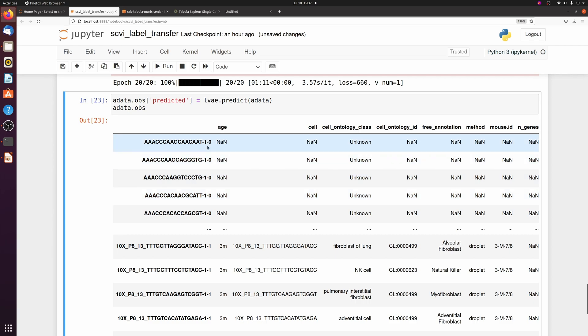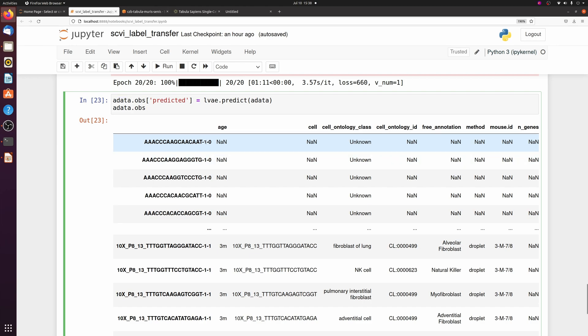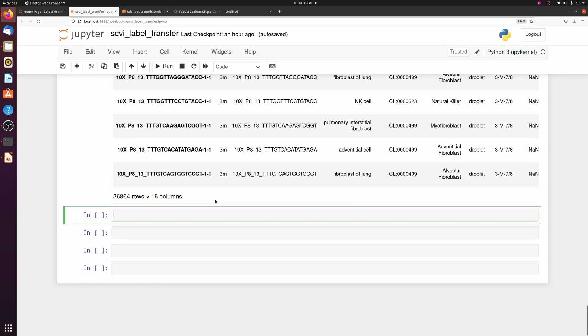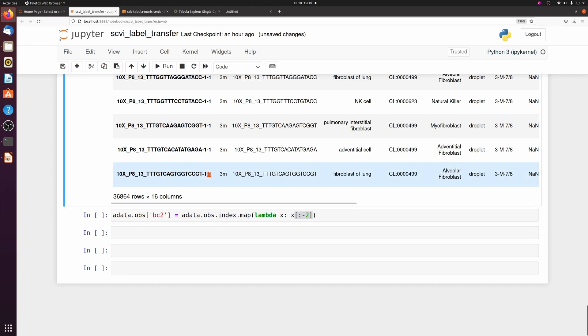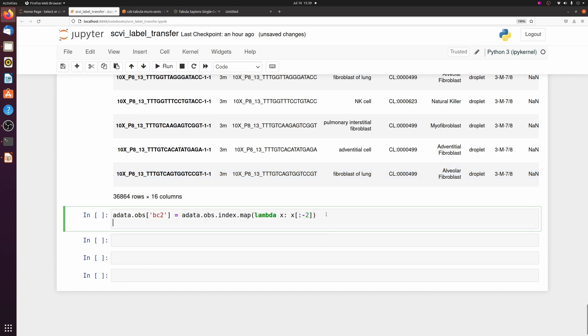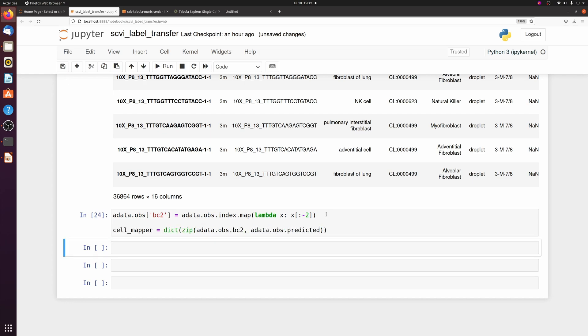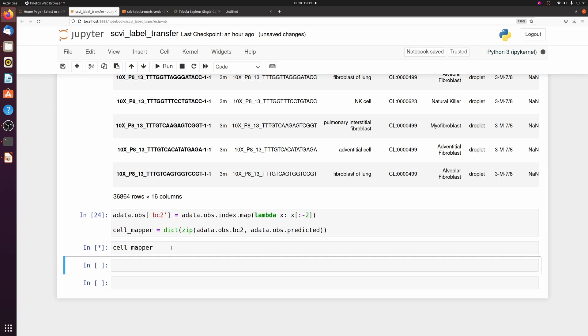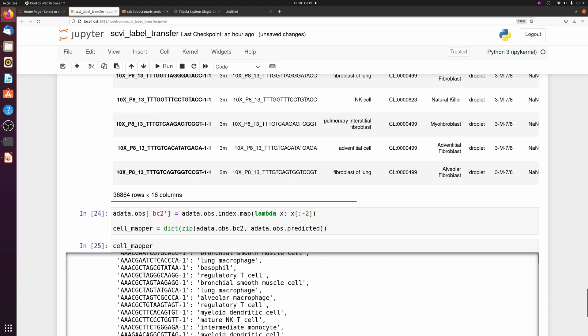So we just added this predicted column, which you see includes our sample cells. There's multiple different things you can do now. What I'm going to do is I'm just going to make a dictionary of the cell barcodes and the predicted values and then map it back onto the raw adata object. So only one extra step we have to do is that when we concatenate it, it adds a dash zero. So I'm going to remove the dash zero and then make this into a dictionary. I'm just going to make a new column called bc2, just barcodes two. Then it's just going to be everything in the index except for the last two characters, which is the dash one or dash zero. And then I'm going to use bc2 and the predicted column to make a dictionary.